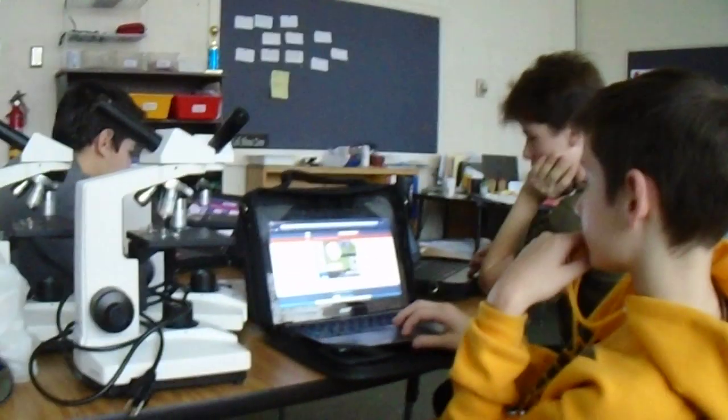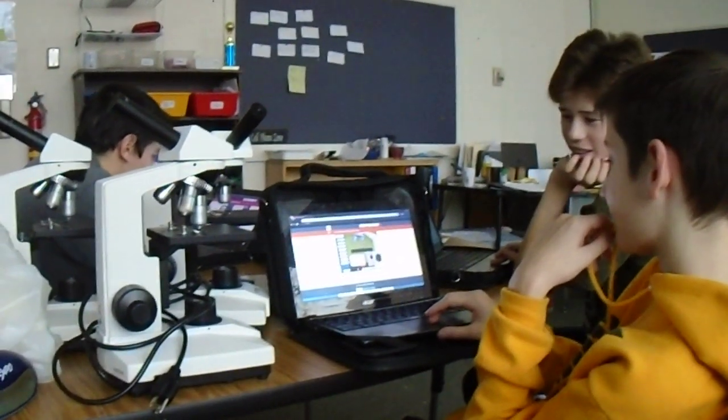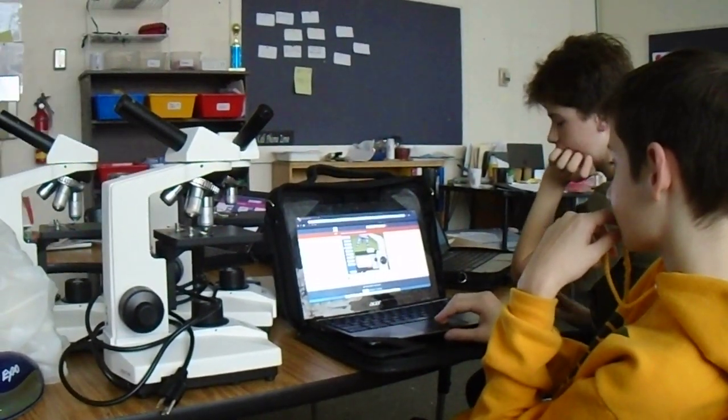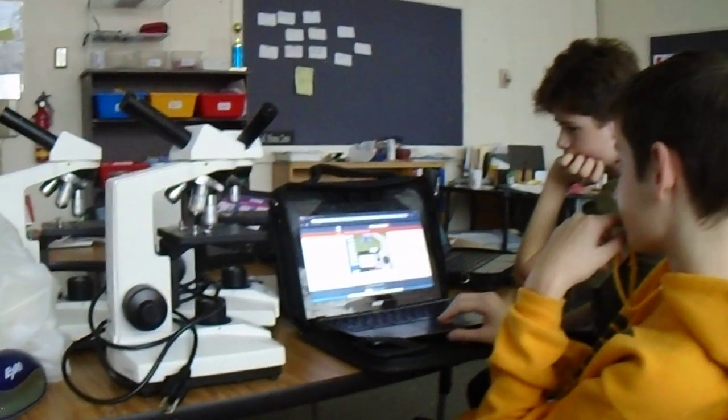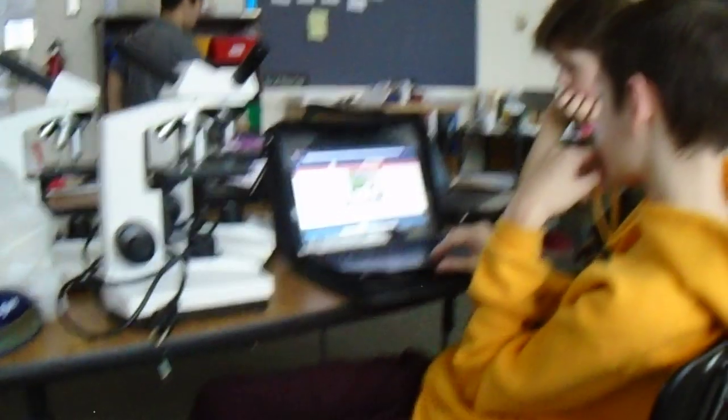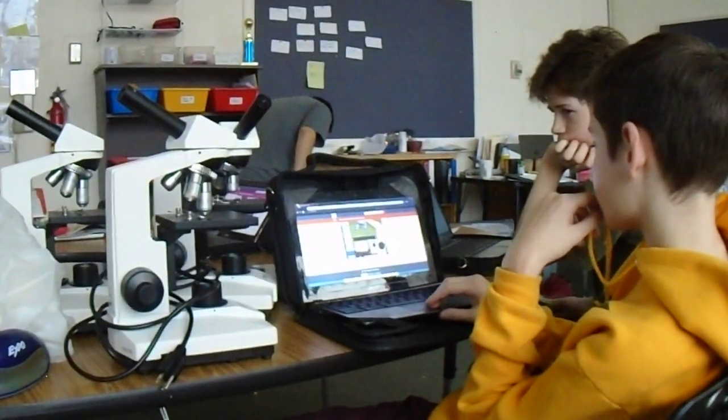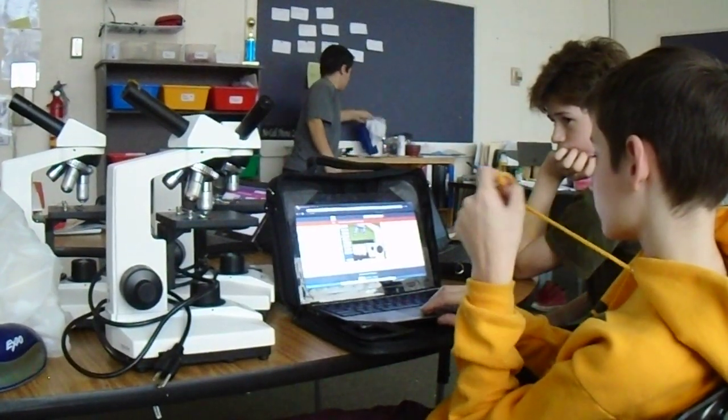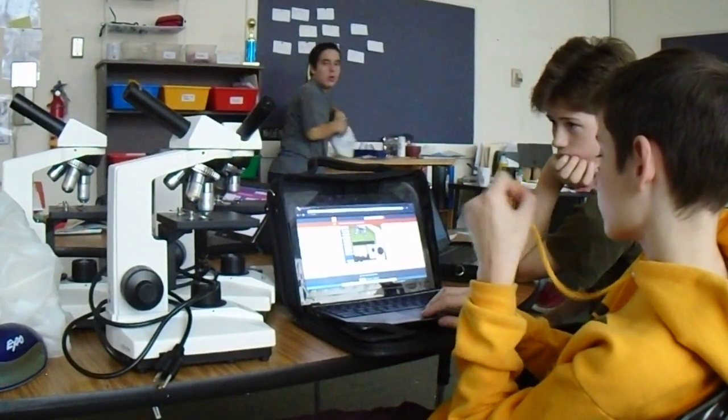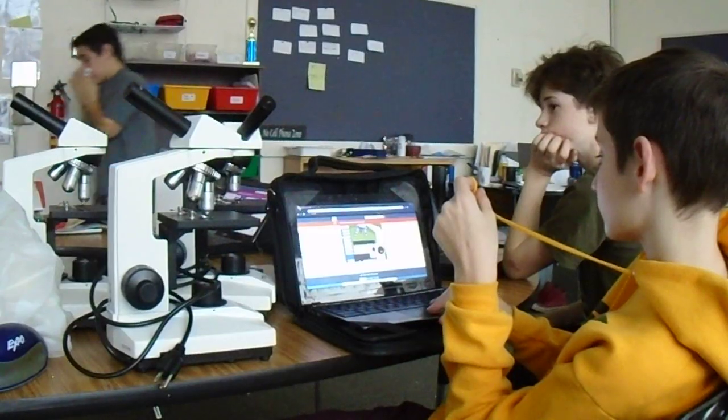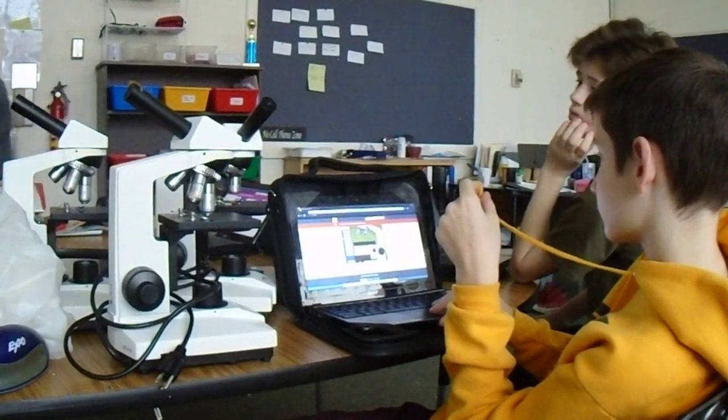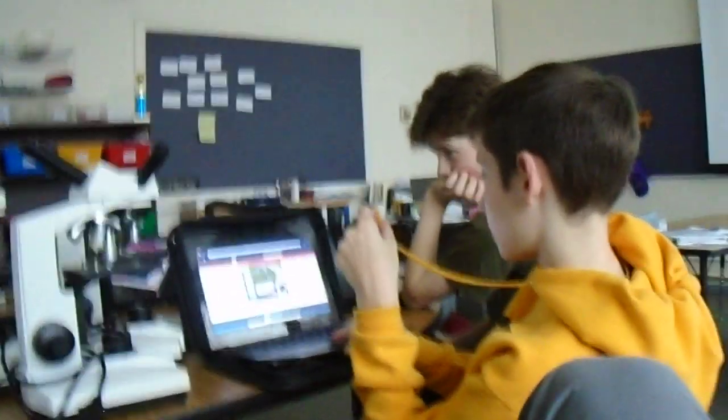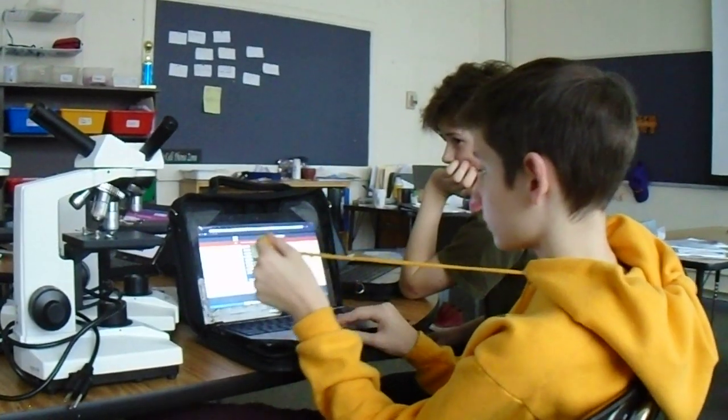It's time to focus the image. There are two knobs on a microscope used to focus the image. One is the coarse adjustment. The other is the fine adjustment. When focusing, always start with the coarse adjustment. This lets you focus the object relatively quickly. Okay, so we're going to start with the coarse adjustment. Which one was that, the larger one or the smaller one? Larger. Larger one.